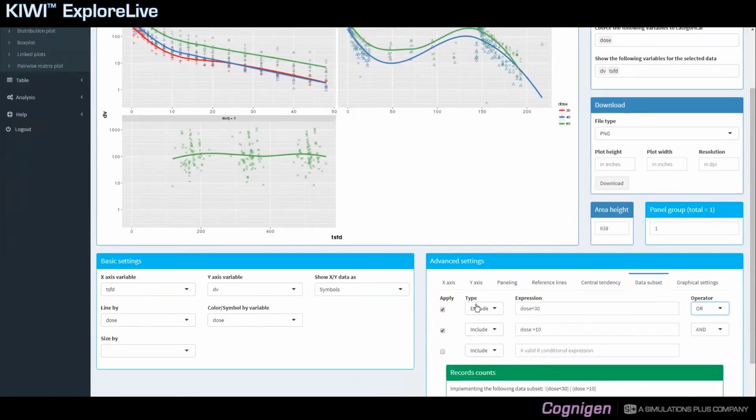Finally, the last thing that you can do is include or not apply any of those expressions and see what it would do. I don't think that changed much, this one, but this one probably does. Yes, that changed the expression.